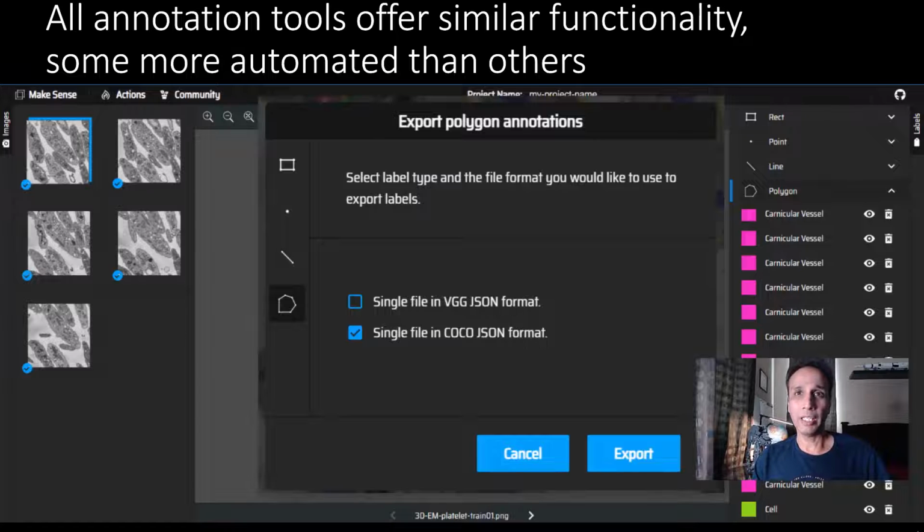But before getting there, let me just flash this one screen where once you annotate this, you can export them in multiple formats. In this case, you can export them as COCO JSON file format, and you can work with these. So if you're starting from scratch, you can actually annotate directly in COCO JSON if you know that you're working with, for example, Mask R-CNN style.